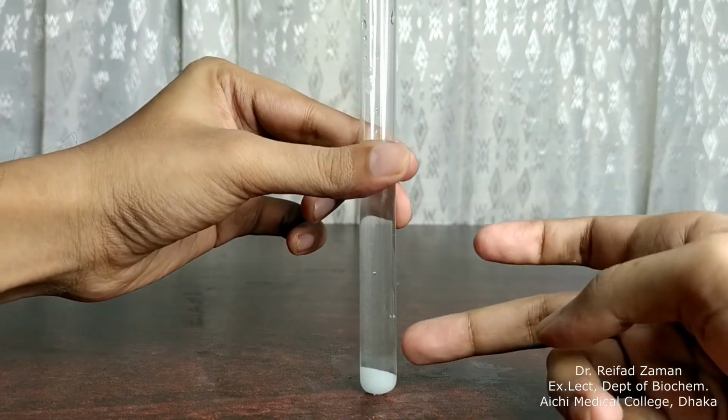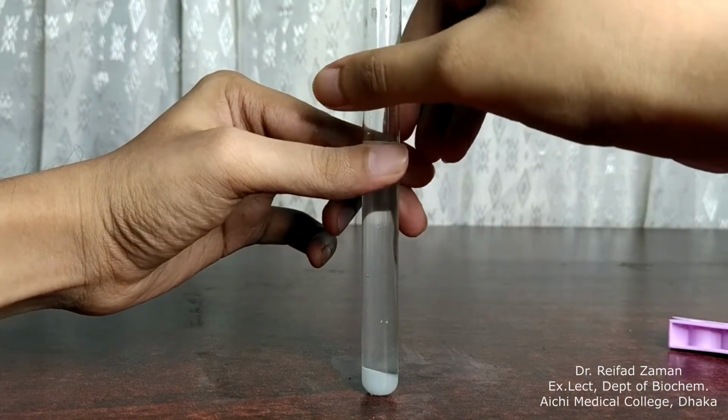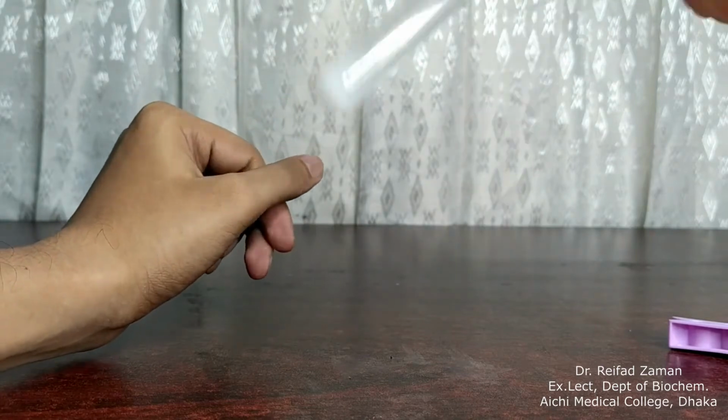So as you can see that the salts have deposited at the bottom, and let's make it a uniform mixture. So we are just going to shake it.